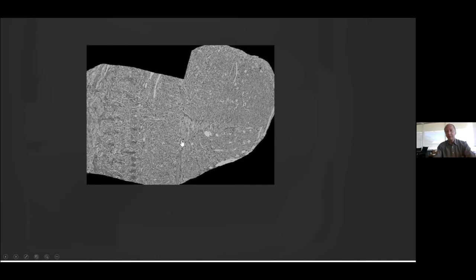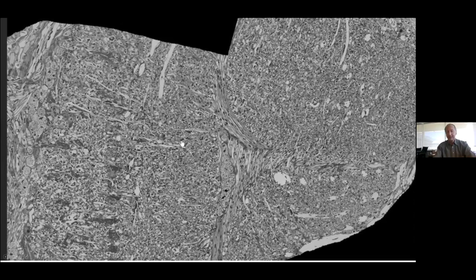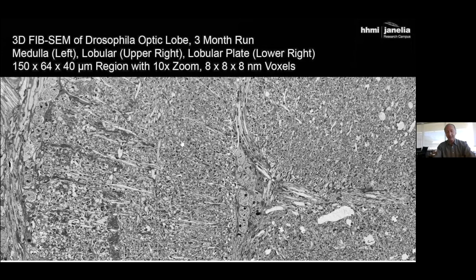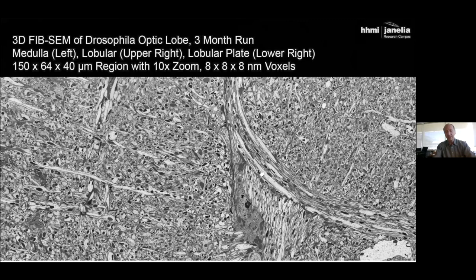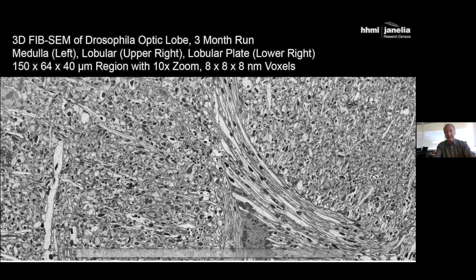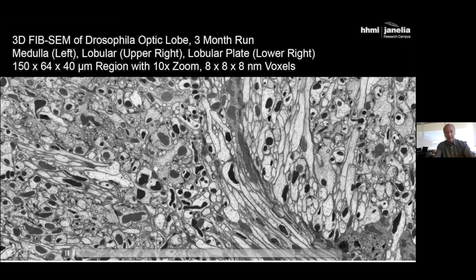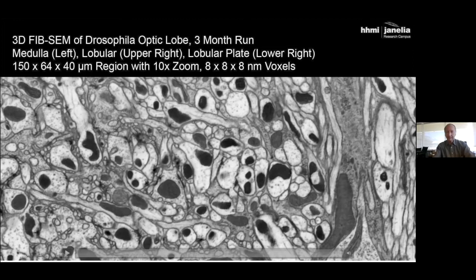We put that all together. And first pass, we're able to image a larger part of the fly. This is now with three months of operation. This is the optic lobe. You can see the fly has a lot of wiring inside its little brain. If you zoom in, you're seeing this crisscrossy braided pattern, the chiasm. You saw a nucleus go by. The dark little circles are mitochondria. And when it stops, you'll see little bright areas right here. These are the actual synapses that take place.